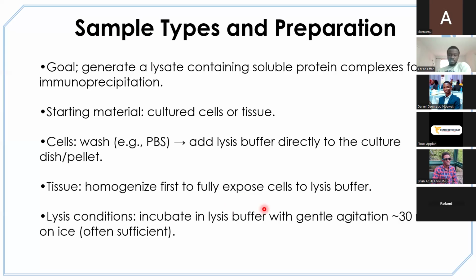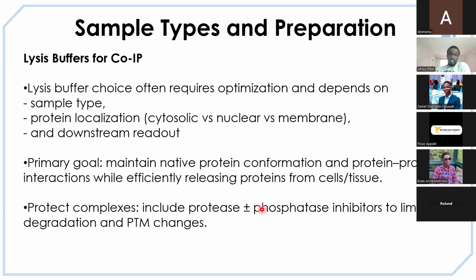So it depends on the incubation period, and also depends on your protocol, how long it's supposed to be on it. Now, the lysis buffer is important, and so it depends on the sample type. The type of sample you are using determines the lysis buffer you are supposed to use, and the protein localization. If your protein is in the cytosol, you don't need a very harsh buffer.